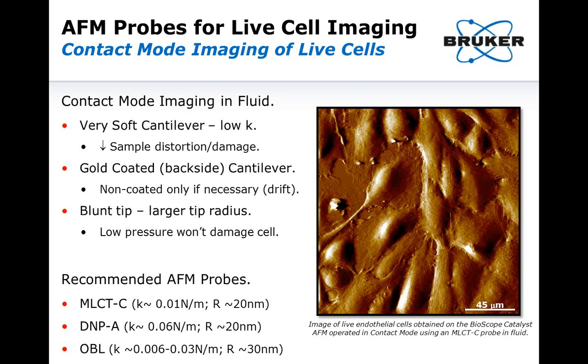In our next example, we're looking at contact mode imaging of live cells in fluid. Here we want a very soft, low-K cantilever, but instead of the sharp tip used for imaging the aquaporin and bacteriorhodopsin in contact mode in fluid, we now want a blunted probe.